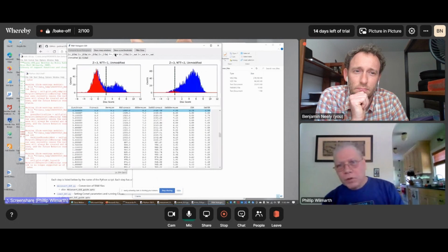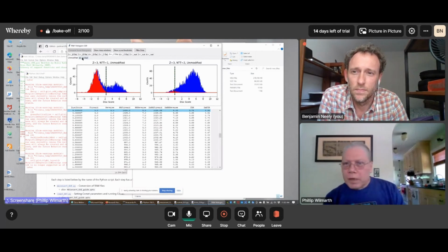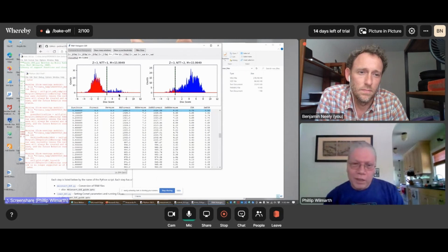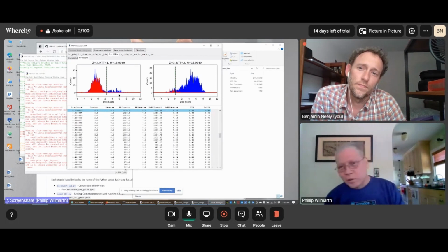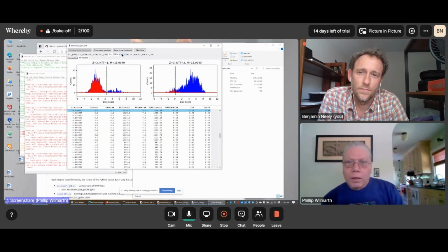Oxidized methionines. This is mostly a quality control step. You sort of see what the score distributions look like. If you're expecting oxidized methionine peptides and didn't see any, you wouldn't see any blue matches in these. So sometimes people are looking for a particular PTM, and this is a good way to validate it. In most cases, those sorts of special PTMs are usually not present in the samples, and you get score distributions where there just aren't any scores for those PTMs. And you can definitively say to someone, that PTM isn't in your sample. So sometimes that's a really nice feature to be able to say with some confidence, no, it's not there. You need to go do a different experiment. But you get that kind of integrated quality control aspect to the pipeline by looking at these score histograms.